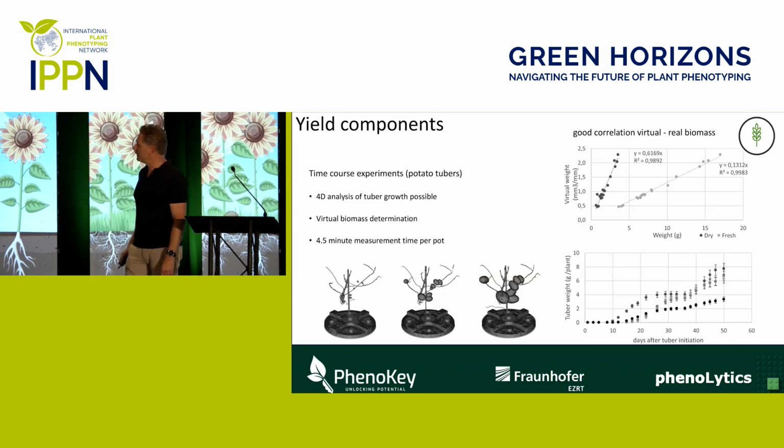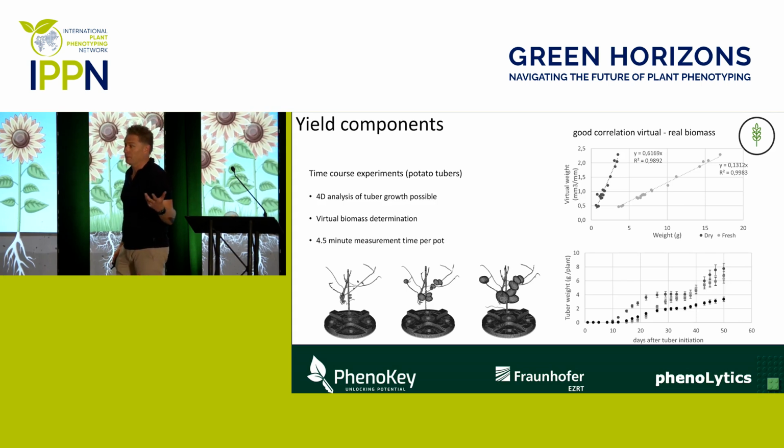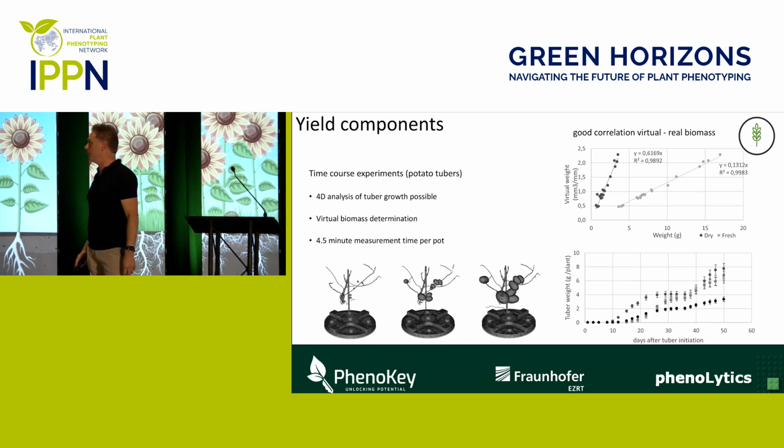So what can you learn from that? Here you can see on the bottom images the development of the tubers, which is already pretty nice to see, how that develops. But it's not only the visuals, it's also the data. So all tubers are segmented individually, and also the biomass of all tubers is quantified automatically in that process.